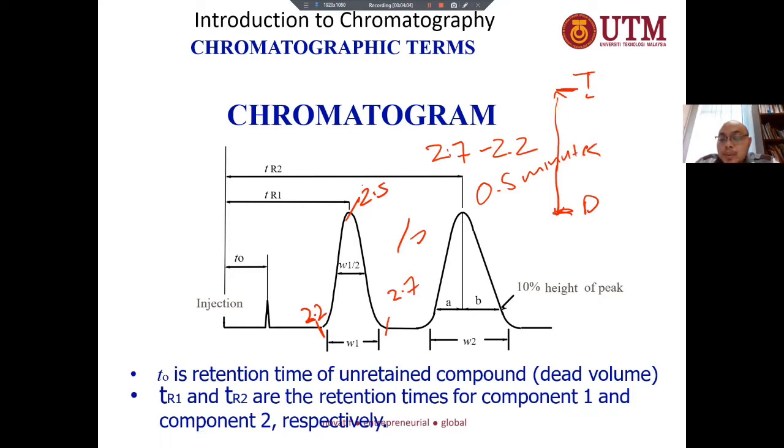The next one we will look at after this. Again, before forgetting, I told you about the baseline. Baseline is the straight line when there is no reading or response. So here is what we call the baseline.